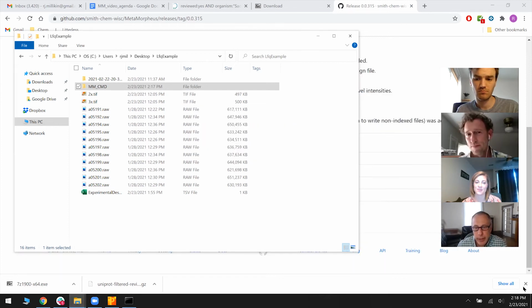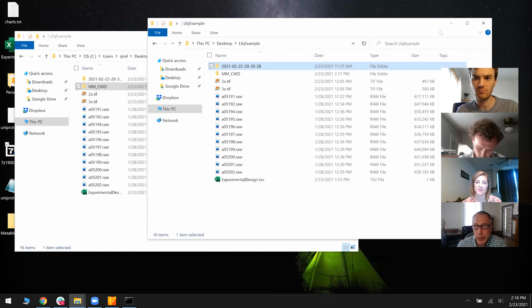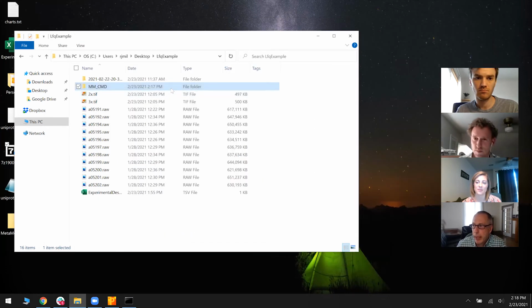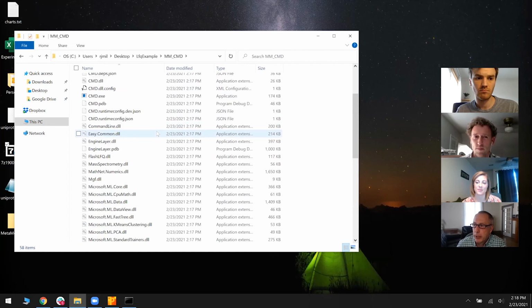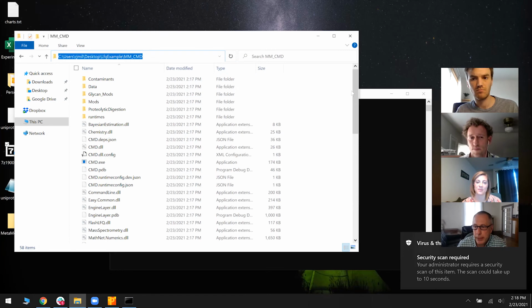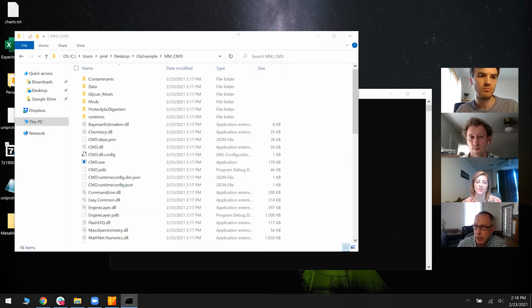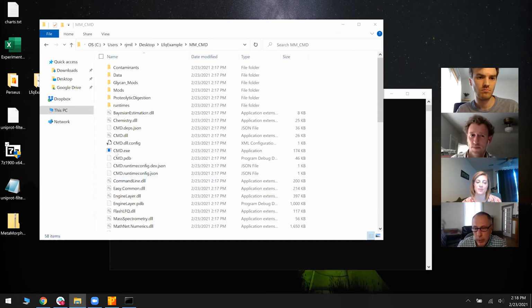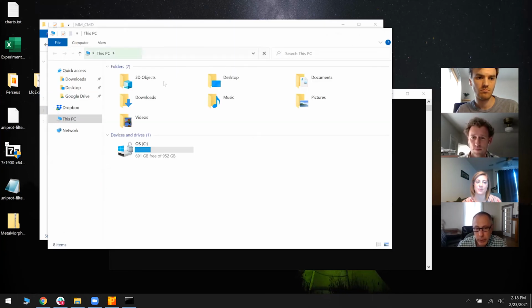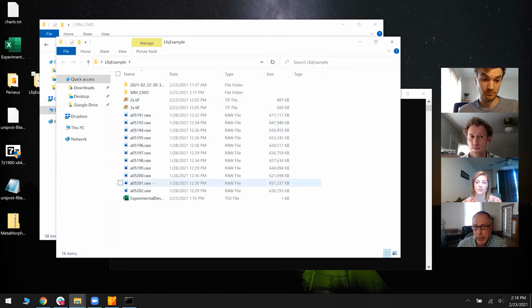Right. So one thing that we did, which is different from a lot of groups, is we try to keep the number of programs really small and add functionality. We're doing cool things like FlashLFQ, and FlashLFQ runs by itself, but it's also in Metamorpheus. The glyco search is in Metamorpheus. What that means is that we're all working together continuously over time, and the tool is evolving. It's not just a one-off thing that gets lost when the grad student graduates. Does that make sense? Yeah.